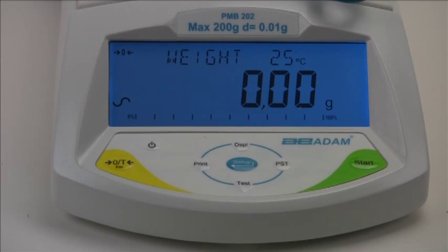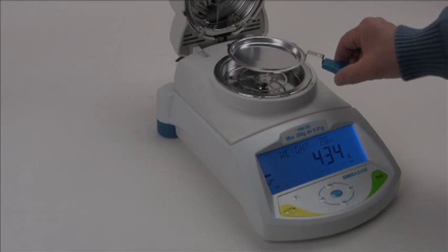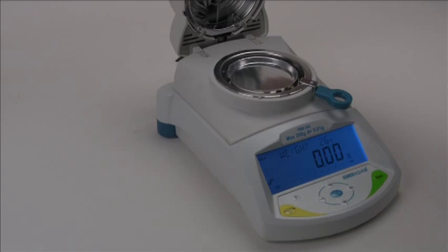The settings we are about to show you are not ideal for all products. You may have to adjust the actual settings for the type of moisture determination that you are attempting to do.